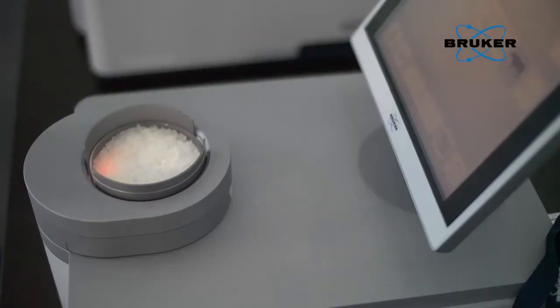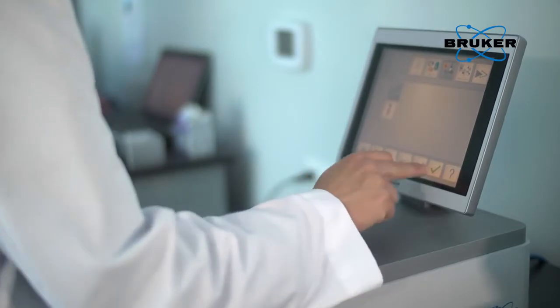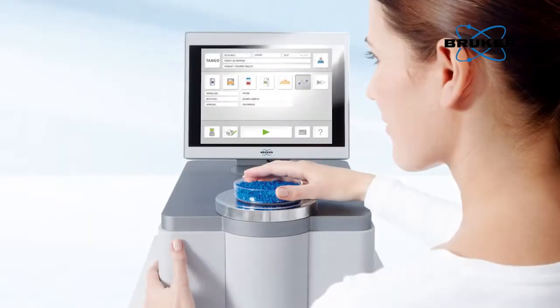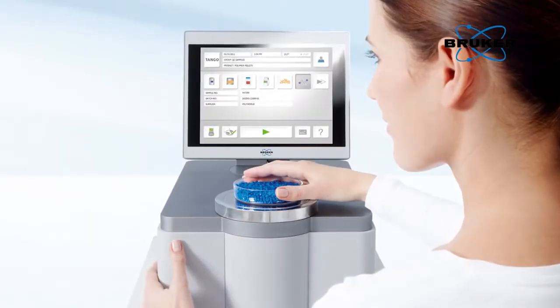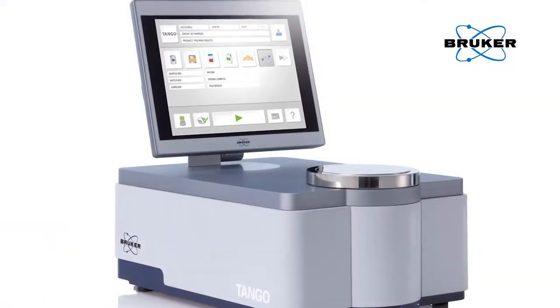The methods or the calibrations that you have on the Tango can be qualitative or quantitative, or both. This is a big advantage of the Tango software, allowing for multi-evaluation predictions. The calibrations can be set up to identify your materials, as well as give multiple component evaluation, all from the same scan.